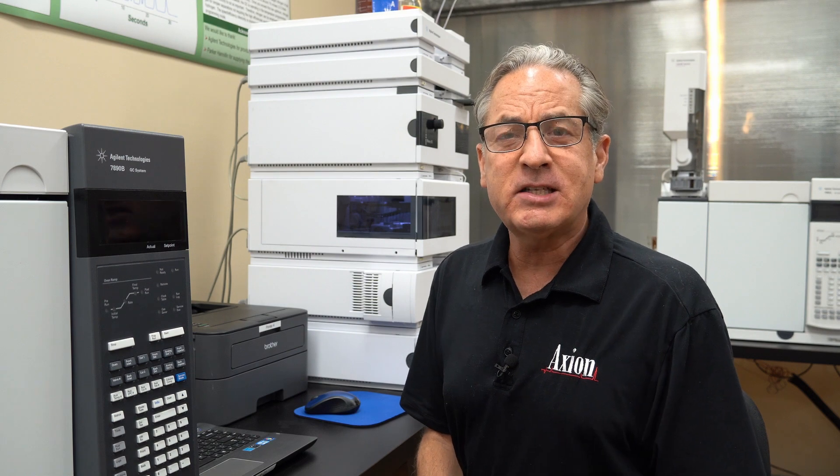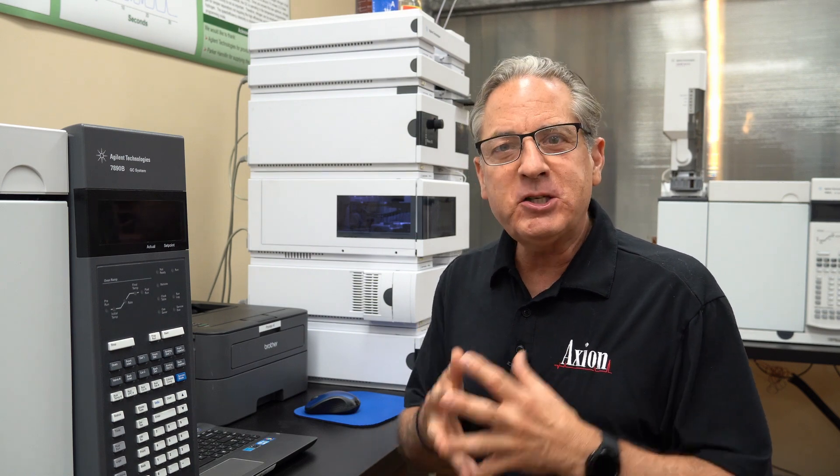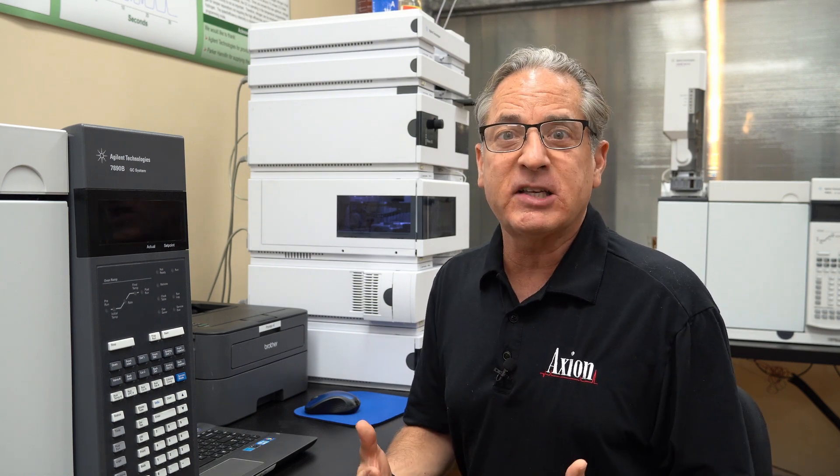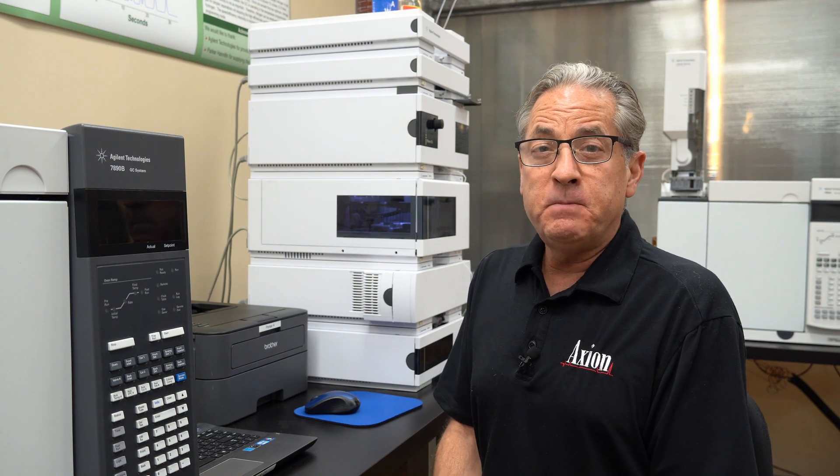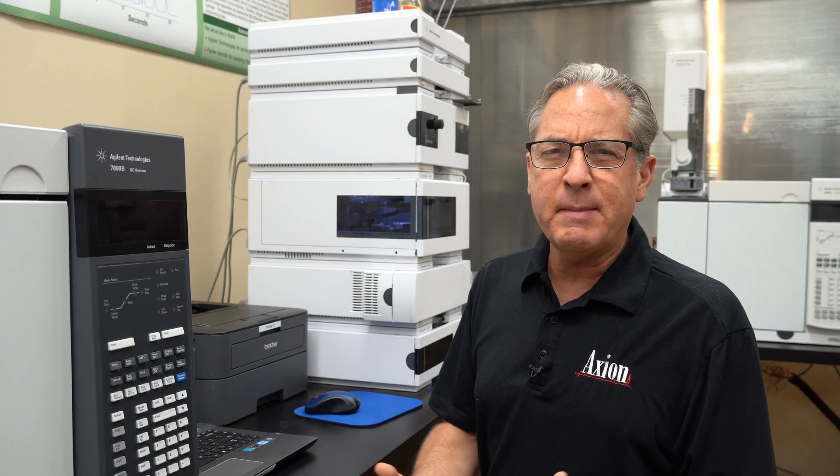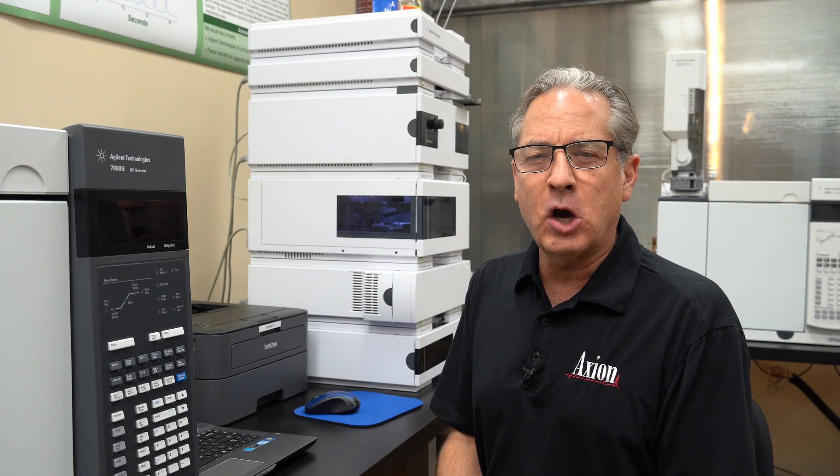So I just showed you how to run diagnostic tests using the software, especially if you have the classic software like I have running on this instrument. This is Agilent ChemStation B.0403. It's a very popular version of the software, even though it came out about 10 years ago.